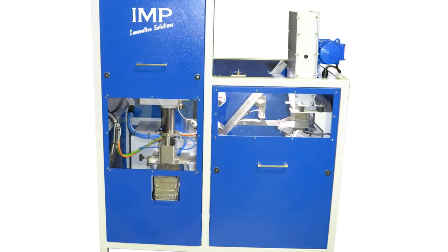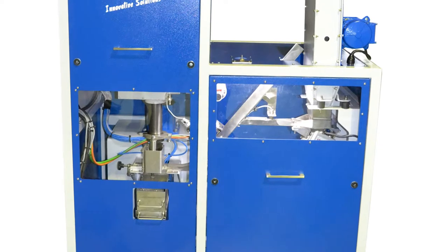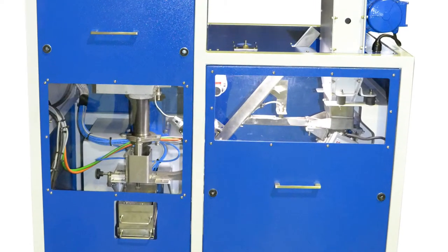The IMP Auto Drill Master is a fast and efficient method of drilling nickel and other non-ferrous samples for analysis.